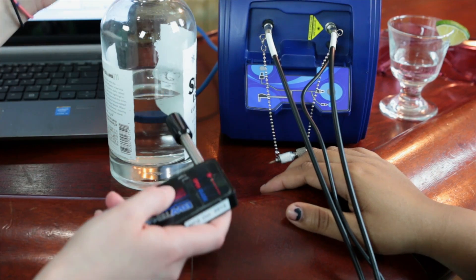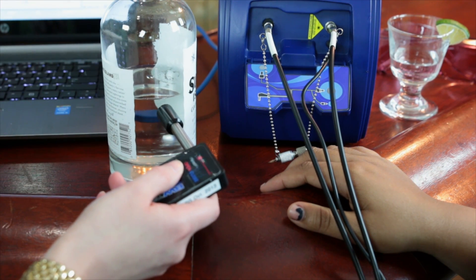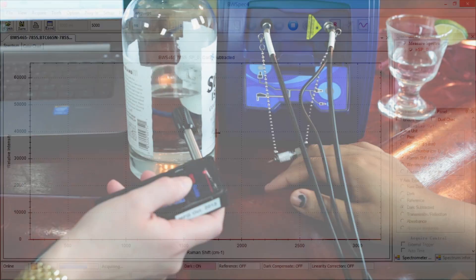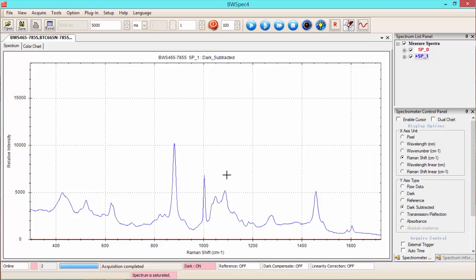First we're going to take a dark scan with the shutter closed. We'll go into the software so that we can subtract that later when we take our actual scan. And now we can take our scan of the alcohol. When measuring the quantification, we can actually measure down to a few tenths of a percent. And based on this, you can see that our rum is safe and methanol-free.